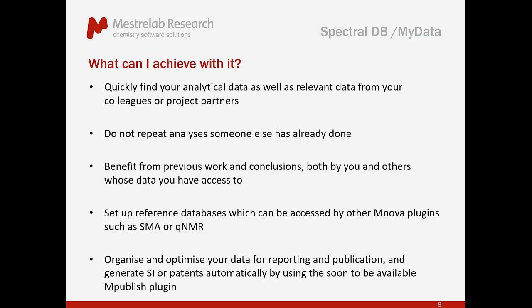And what does the database do for me? What is the value, or what can I achieve with it? Well, firstly, it allows you to quickly find your analytical data and maybe any other relevant data from your colleagues or from project partners, for example.